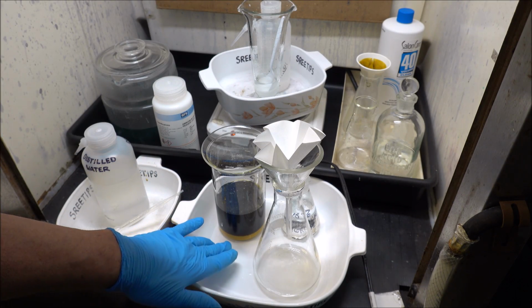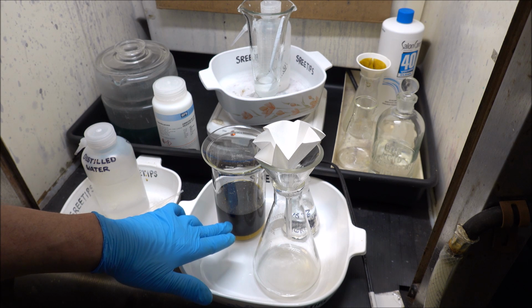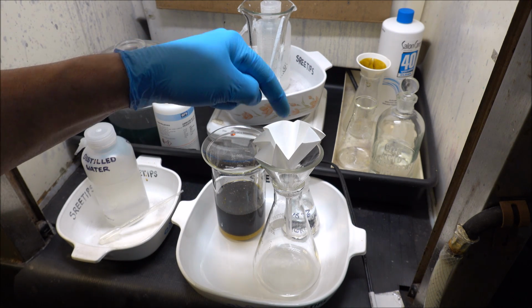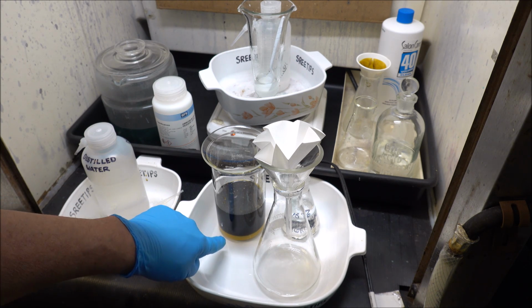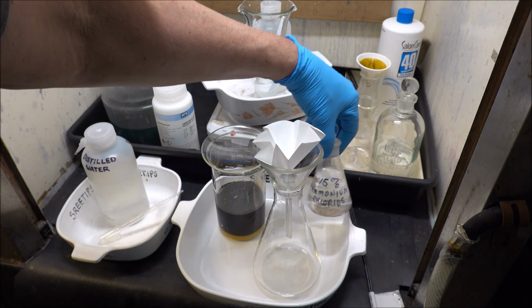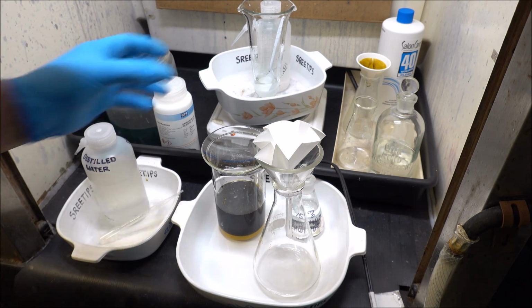Here we are. We've got our platinum salt down here, our palladium solution sitting above it. What I'm going to do is filter out the platinum salt, get it into this filter paper, and then recover the palladium solution in this flask, and then I'll rinse off as much of the palladium as I can with some 15% ammonium chloride water. Go ahead and do that now.